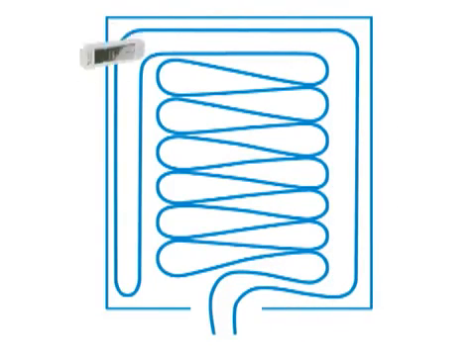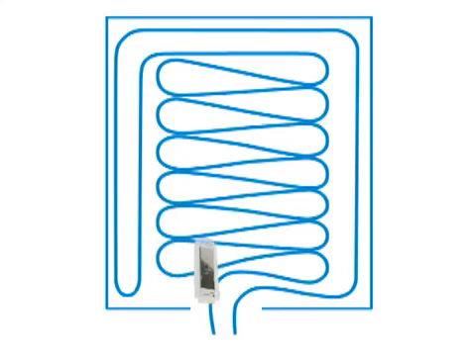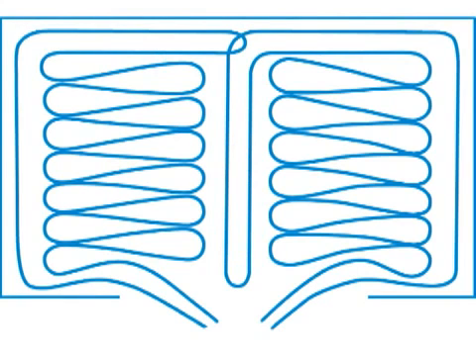Here you can see the wiping principle, taking an approximately 10 square meter room as an example. Start wiping along the edges, then continue with the interior. Rooms that are larger than 10 square meters should be divided into more than one working area. Here you also start with the edges, but only wipe an approximately 10 square meter large area. Then change the mop head and wipe the rest of the room.